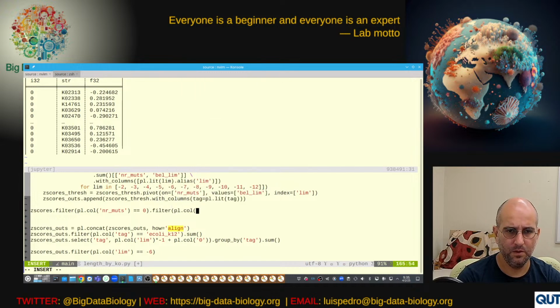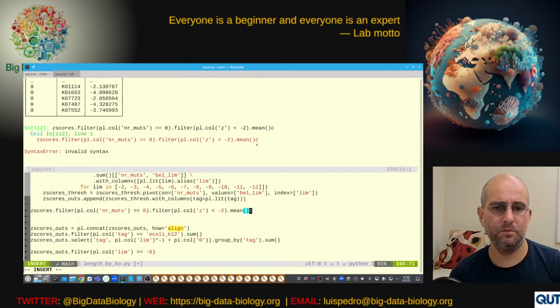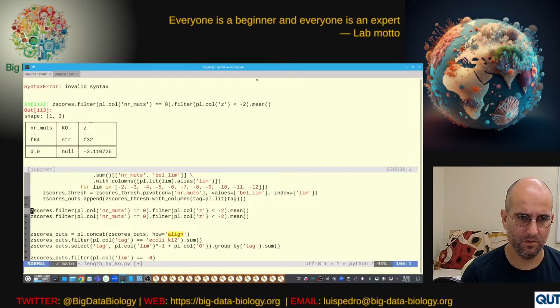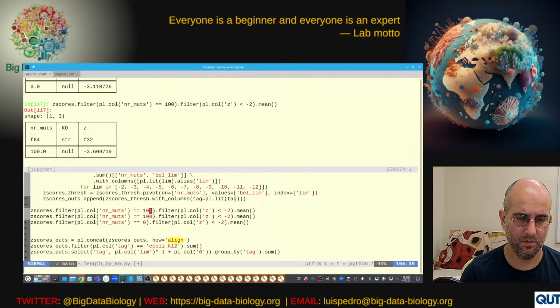Filter. Okay. What about just this? The average, is this terrible? Okay, this is terrible. It's not the average, it's the sum.